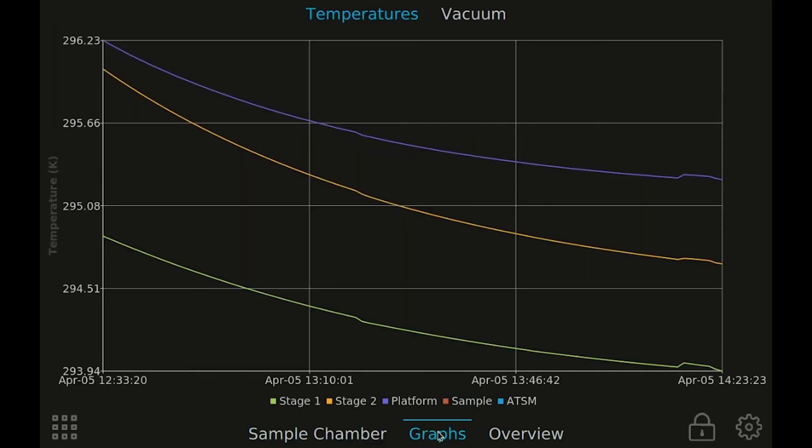The graphs view provides a visual way to see the most important information in your system graphed over time.